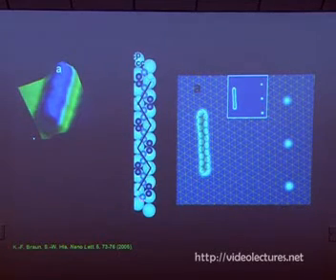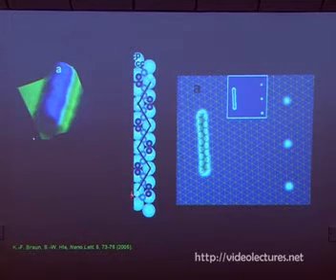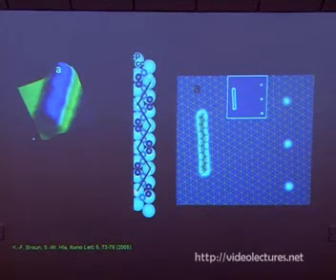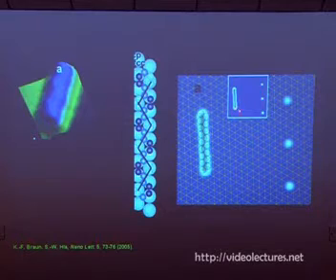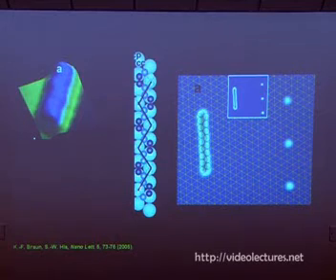It turns out that the carbon atoms from the benzene rings are sitting as follows. On one side of the benzene ring, 2 carbon atoms are sitting on top of the substrate silver atom. The other 2 atoms are sitting at the bridge site. Now, if you carefully look at the molecule, you will see that they slightly wiggle. I show this wiggle here with a line. It appears as this kind of wiggle. And it turns out that the 2 atoms sitting on the top site appear brighter. So there's something interesting there.